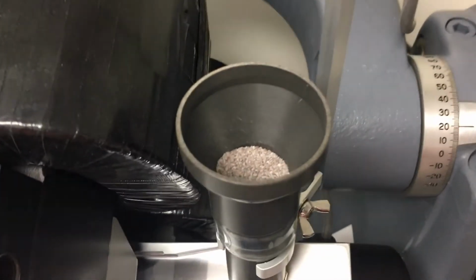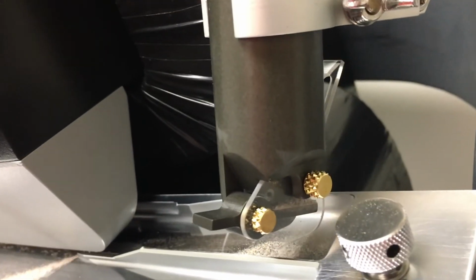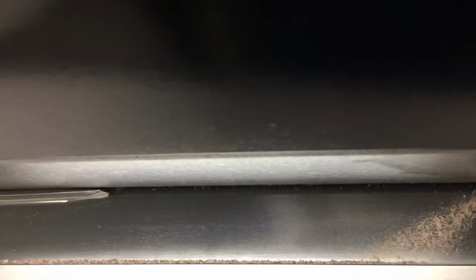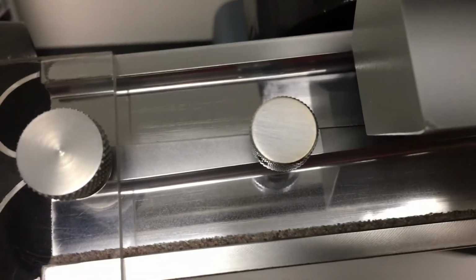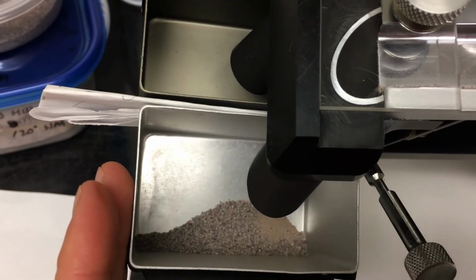The Frantz works like this. The sample goes in the feed here, which is vibrating. Sample falls out the bottom, runs down the chute, which is also vibrating. This is the magnet, so each little grain that is magnetic is staying in the upper chute. The grains run downward in this chute until the magnetic grains are up there, non-magnetic grains are down here, until they reach the magnetic pot and non-magnetic pot.